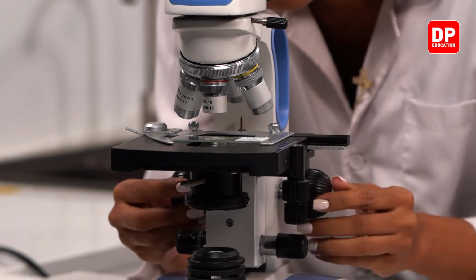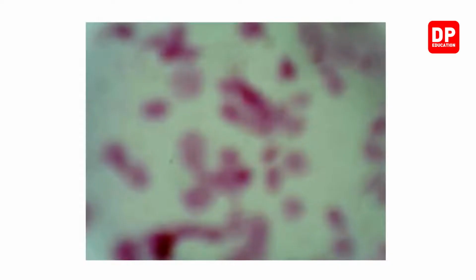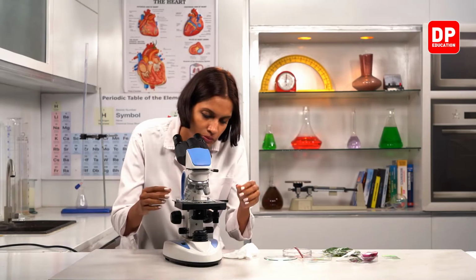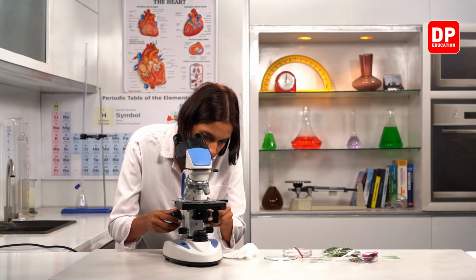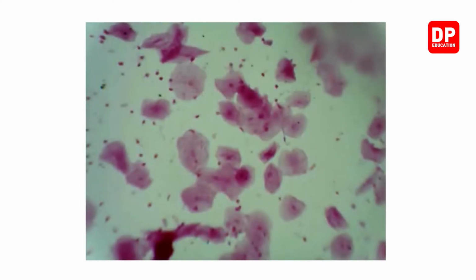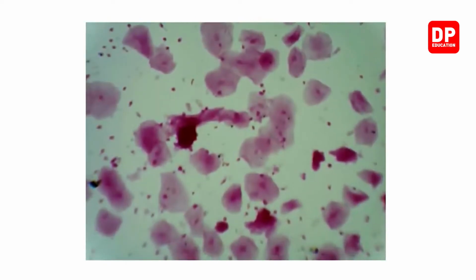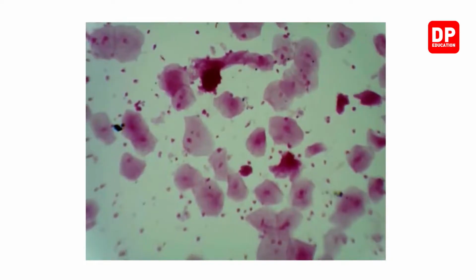Right, children. Check whether you all can see the cheek cells. We'll put it to the next power so that you can see it very clearly. Right. Now check whether you all can see, children. It's very clear. The cheek cells are a bit round in shape. Right, children?